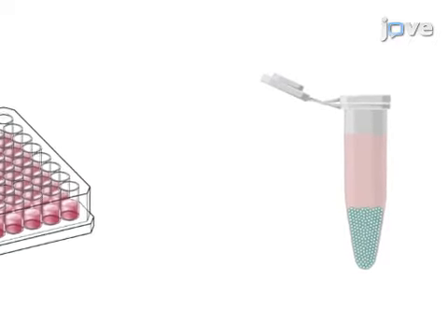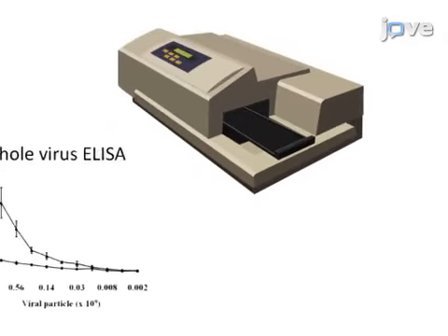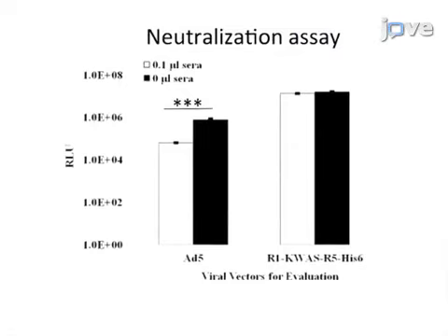Then, the viral titers and the antigenic display of incorporated antigens on the viral capsid are characterized. Finally, the potential of the divalent adenoviral vector to circumvent neutralization by Ad5-positive sera is evaluated.